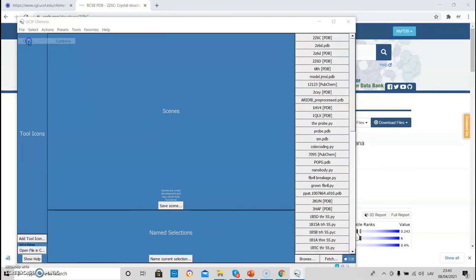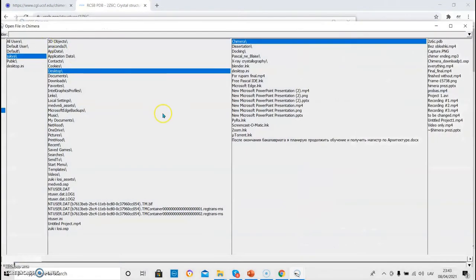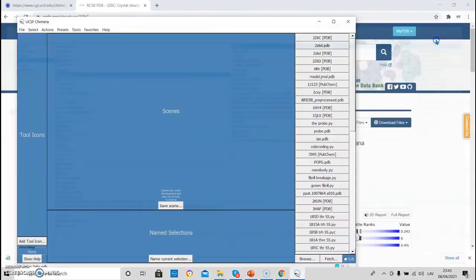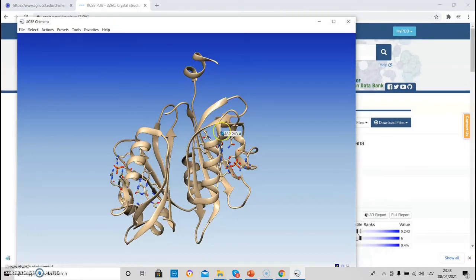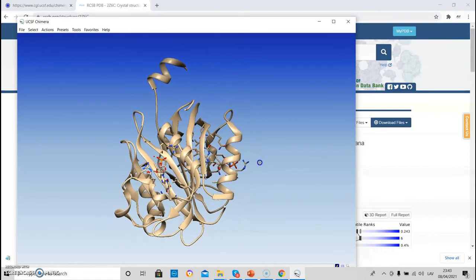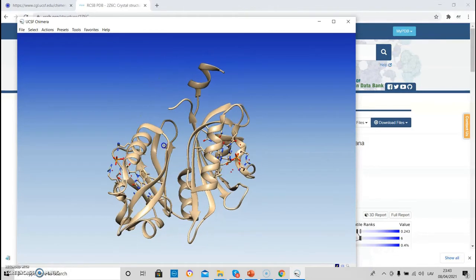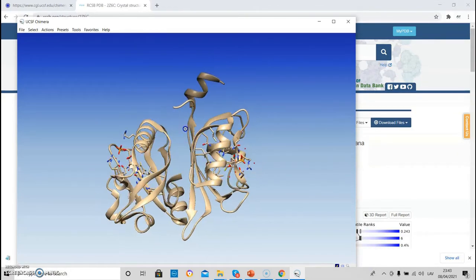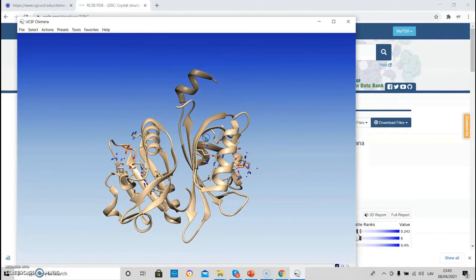This file can be also loaded in Chimera using file open. Go to the corresponding folder and open the file by double-clicking on it. And it also loads the structure.